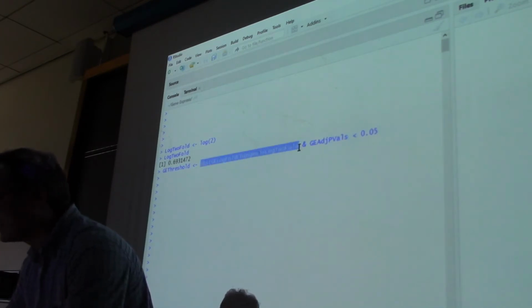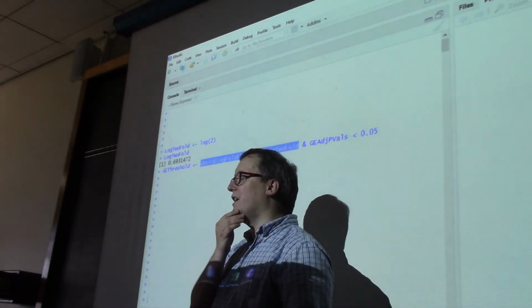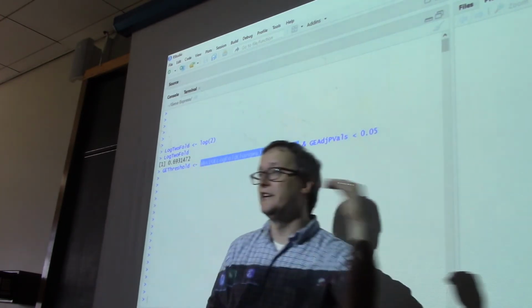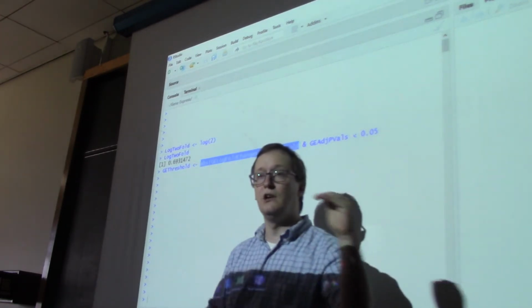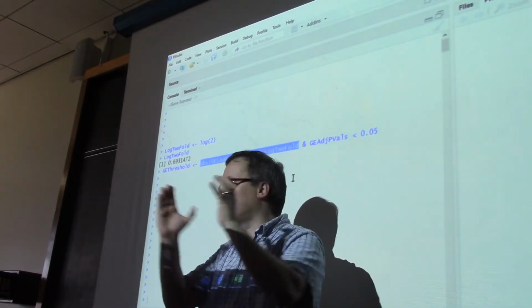The other rule is a little bit complex. We are looking at this on the log fold change scale, which, as you recall, is whether it's to the left or to the right on our volcano plot. And we care about things that are not close to 0.